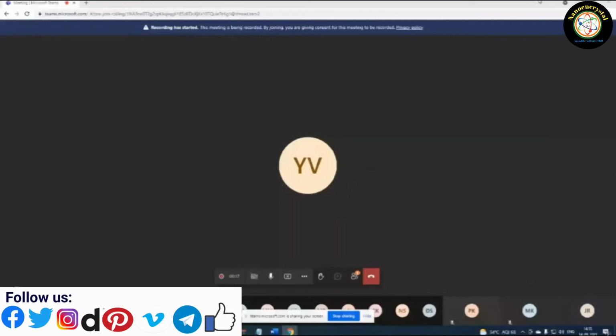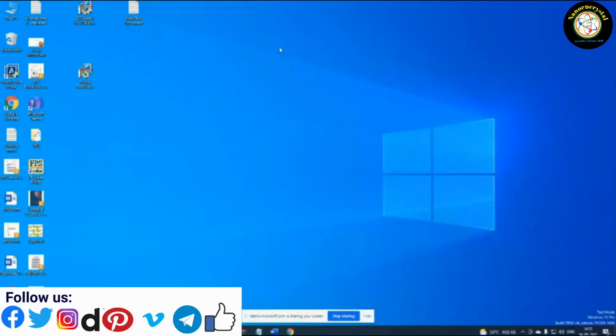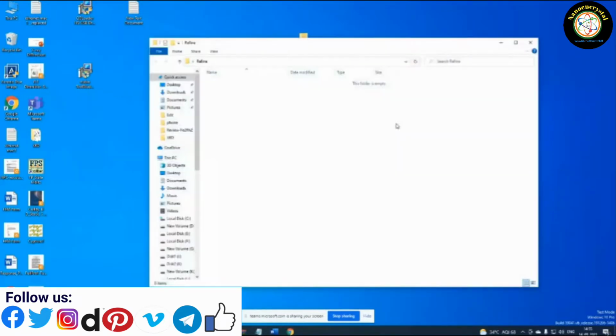So let's take, I'm starting in front of you, for example, one system. That's a CoRuMnSi system. Let me make a new directory. First the student will get this kind of data.